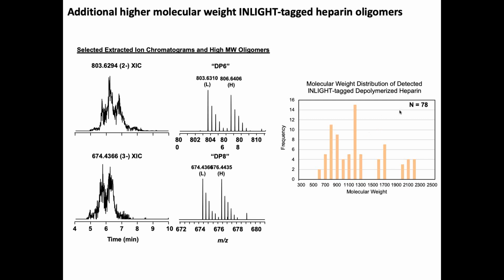And so that ability with the tagging to say what's different is the first step that we're going to employ, if you will. And then once we know something's different, we hope to get some sequence information, some idea of what it is. But in all likelihood, we're going to have to come back to the well multiple times and run multiple runs on the system with different conditions, different MS parameters to actually get at what it actually is. Okay, so we covered a lot of ground.